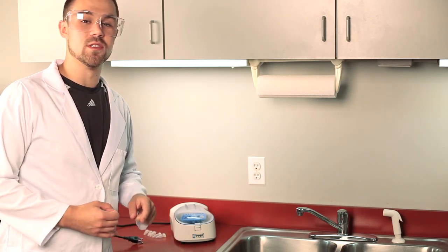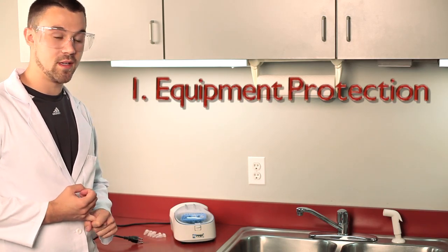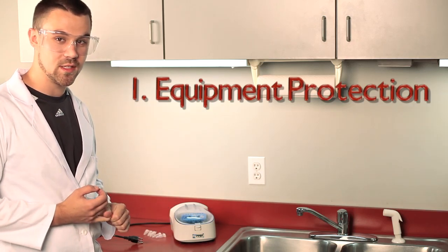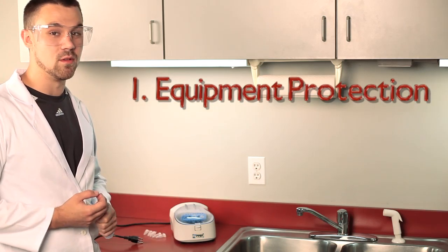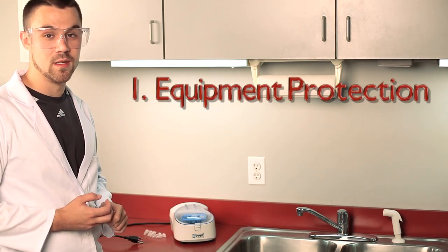Balancing a centrifuge is important for many reasons. One, damage to your equipment. As you can see, this one was wobbling all over the place, and if you're not paying attention, it could wobble right off the table and shatter, and then you're out of a $300 piece of equipment.